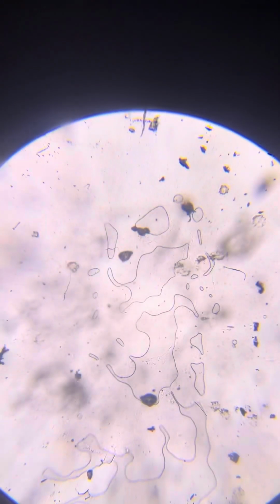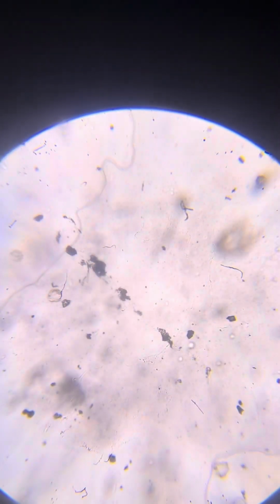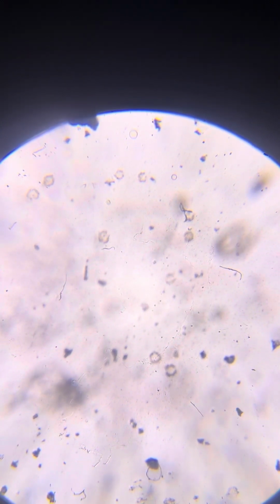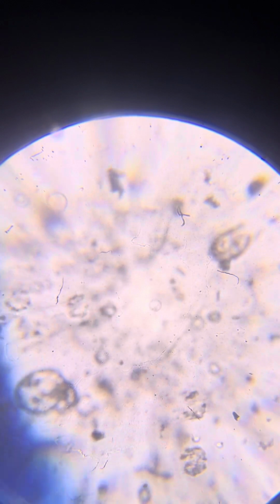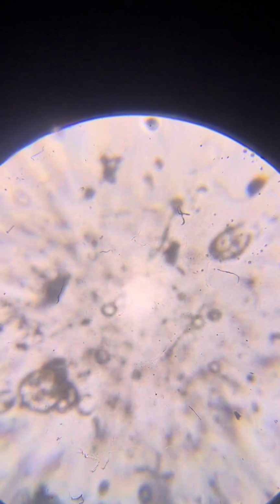So we also see remnants of life forms, but we don't really see neros. Is there a nero over here? Is that a nero? Let's try to zoom in. Yes, this is actually a nero. So we do have a little bit. Some actually survived.